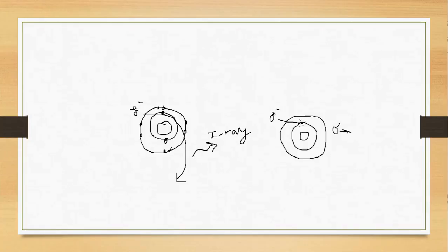What ends up happening is an electron from a higher shell will come here and fill this one. Now this has a vacancy here, and as a result, you get an X-ray with respect to this transition. There are normally two types of characteristic X-rays, at least the ones that are normally known. They're referred to as K alpha, like this. Let me delete this here.